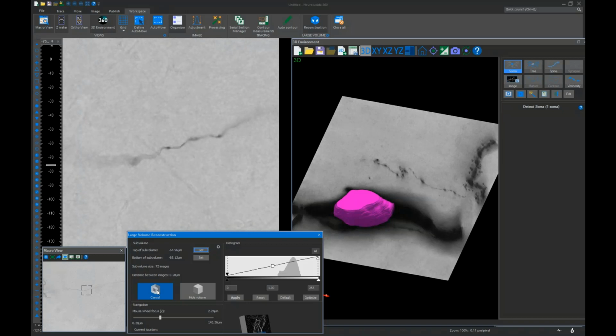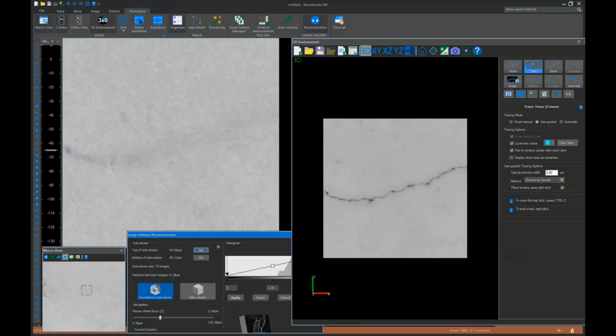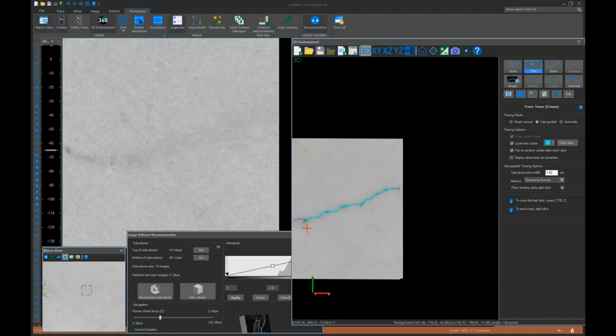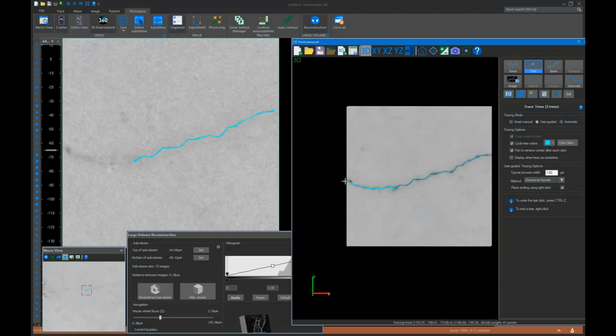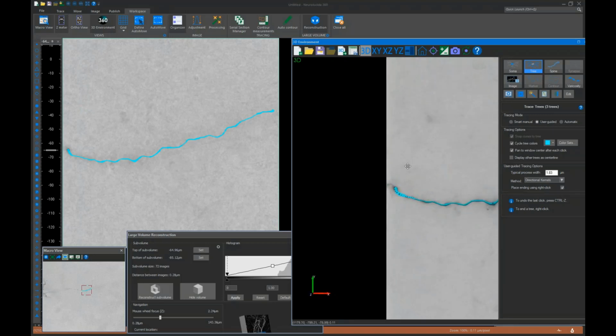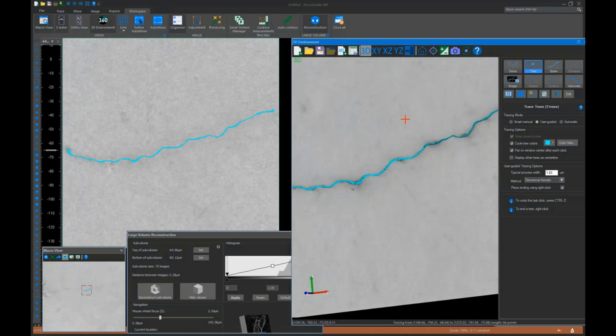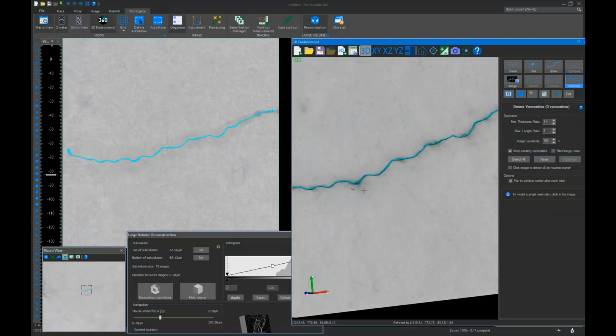So if you have a very complicated structure like the axonal arbor, where that's really fine and tortuous and changes the way that it traverses regularly, this tool is going to be a savvy way for you to quickly and easily work with this volume. And so in this case, in 2 clicks, I've reconstructed this axonal volume here. And now I'm going to detect the varicosities.